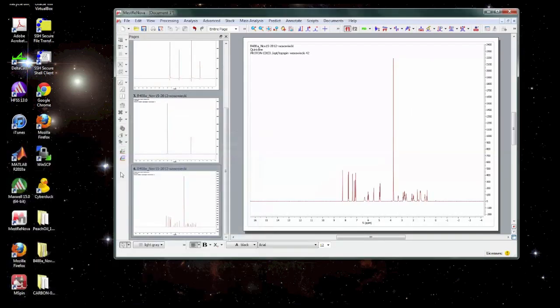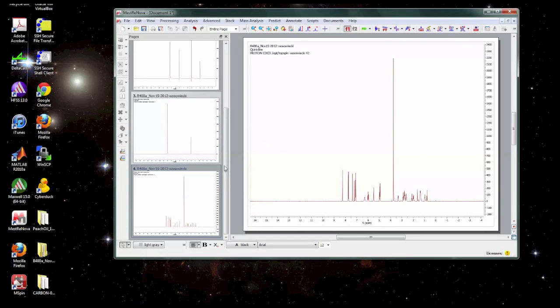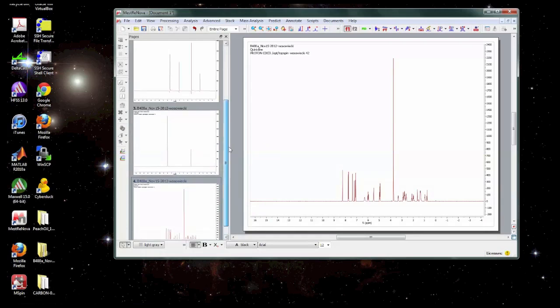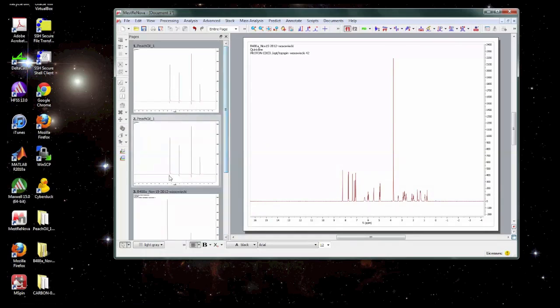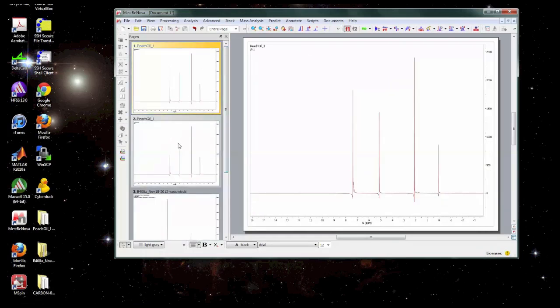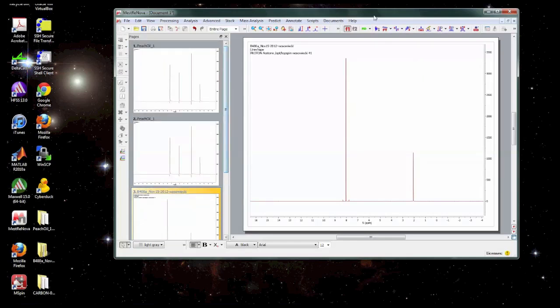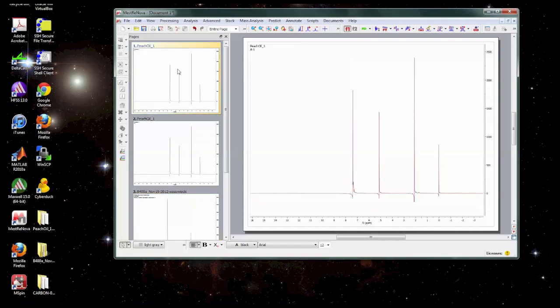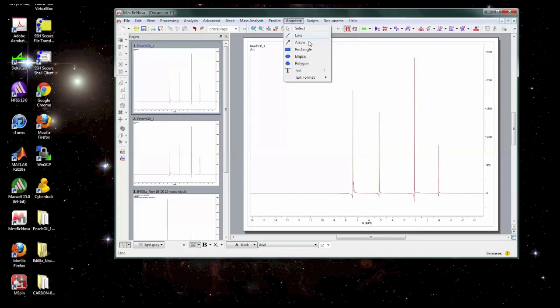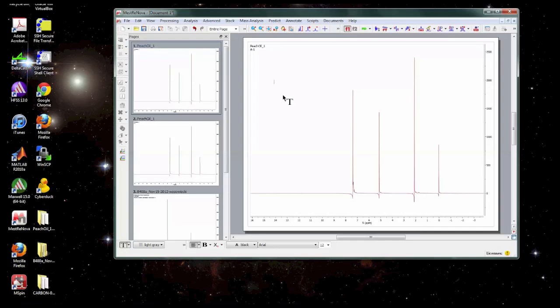Once you've got the data open you can see if you have multiple spectra open you'll see them as separate pages here and Mestronova is designed to look and act a lot like PowerPoint. So whichever page you select will be represented in a larger form here and you can also do things like you can do in PowerPoint. You could add text or graphics, this can help you display the data the way that you want.